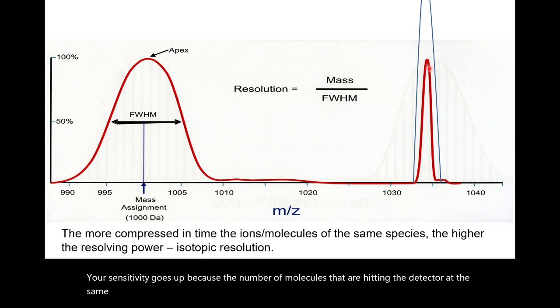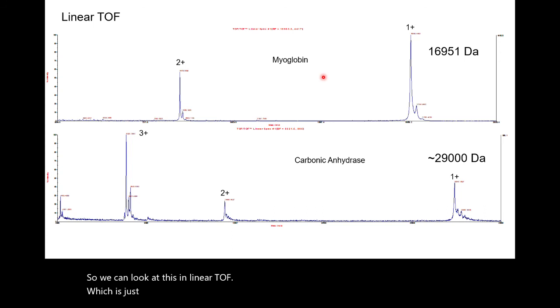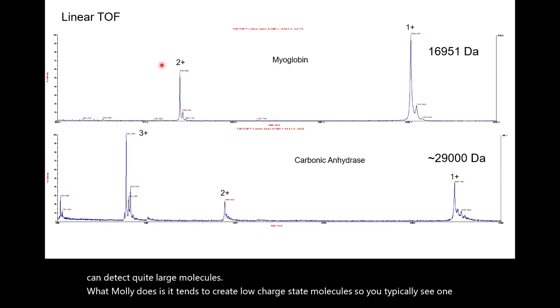So we can look at this in linear TOF, where we start from the source and it's just a straight flight path to the detector. We can detect quite large molecules. What MALDI does is it tends to create low charge state molecules. So you typically see 1+ ions, and sometimes you see 2+ ions.